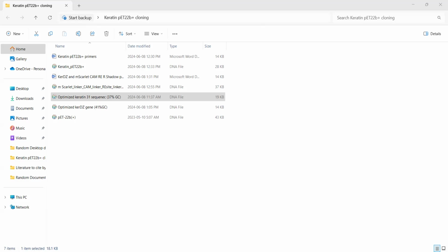So you could work from here or you could design primers here. It's up to you, but the sequences have to match in both. So here is what we'll do. This is our keratin. Now, our forward primer for keratin is here. Again, we will try to keep it at 20-something. Let's say 23. Control copy.